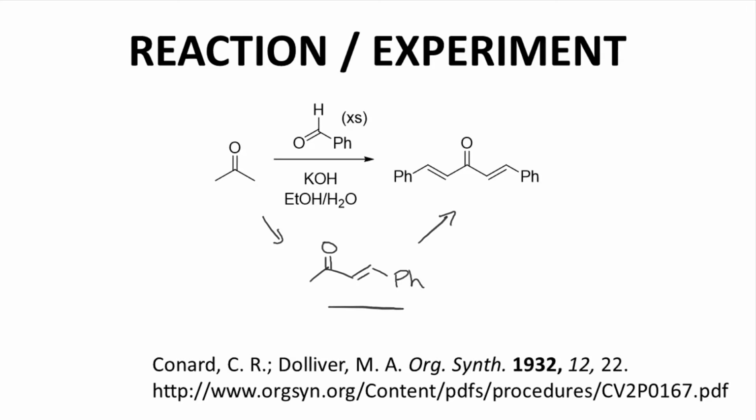The key to the success of this reaction is the solubility of the product. The initial product that I've shown toward the bottom likely initially forms in the reaction as a somewhat soluble oil. This initial product continues to react and forms a very poorly soluble, higher melting product that rapidly precipitates from the reaction mixture.